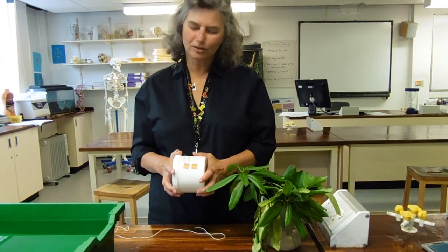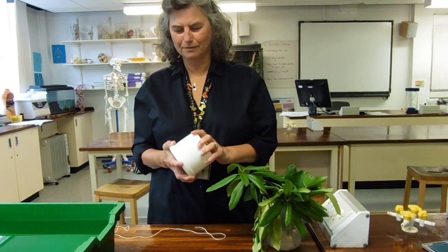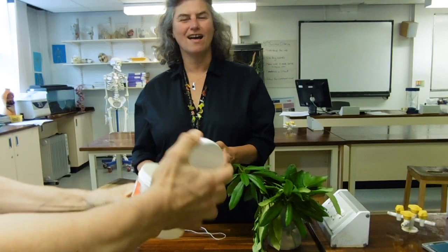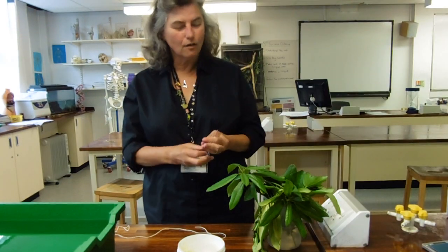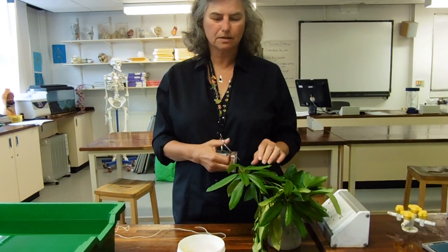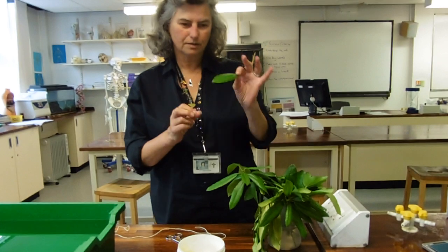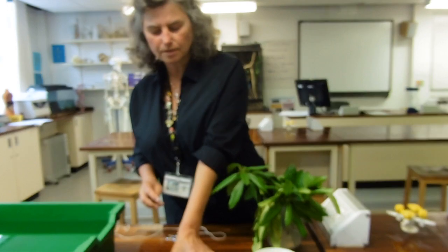We're going to look at a few transpiration experiments, seeing as we've got the potometer stuff out. I started thinking we'd do some videos on potometers, and then I thought there are more transpiration experiments than potometers. The ones that have come up in the past are the good old get-some-Vaseline-on-your-leaf experiments, and there have been a couple of questions on that.